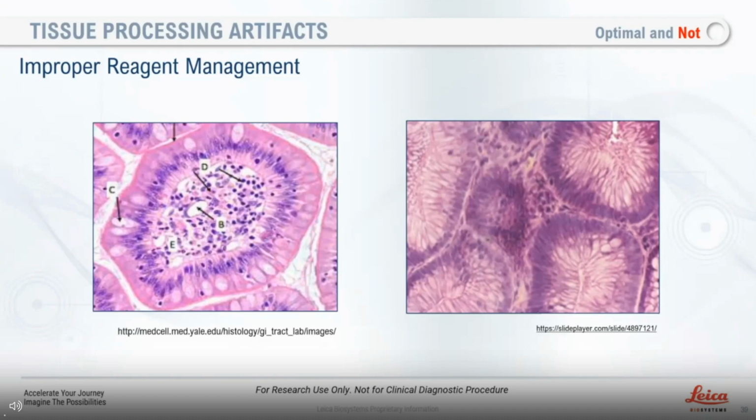Next question. What would be an effective way to decalcify arteries? Make sure that you have plenty of fixation. The standard fixation time in the research arena, I know, is usually around 24 to 48 hours. And all of the research folks are great about moving that tissue out of fixation into 70%. But once you're confident that it's fixed, then you can place the tissue.